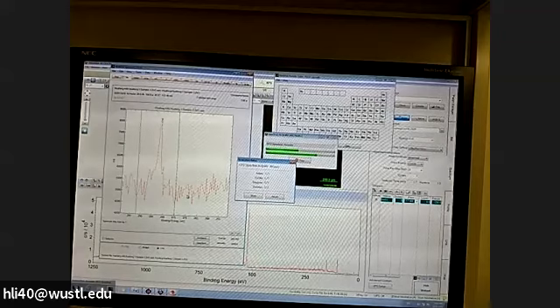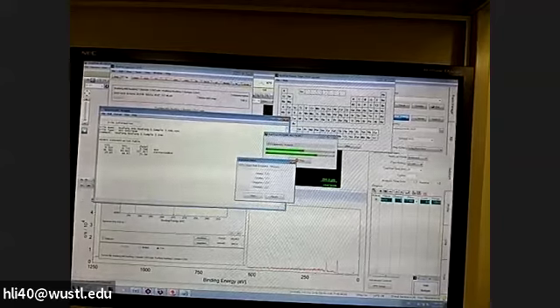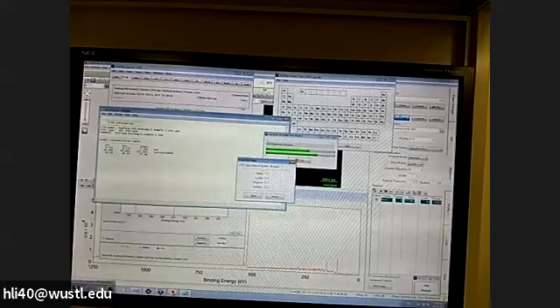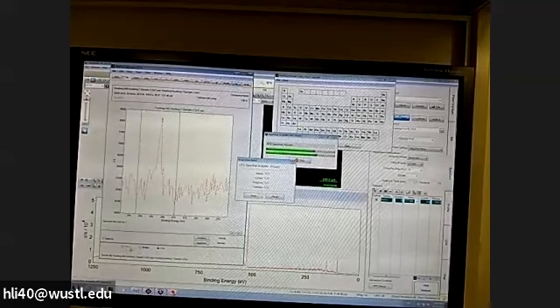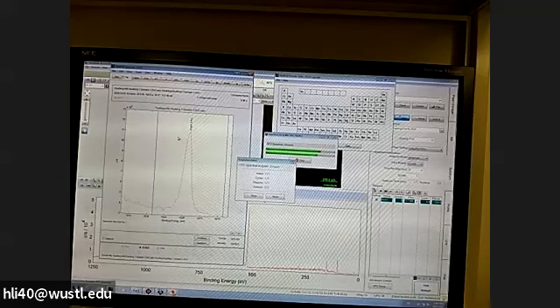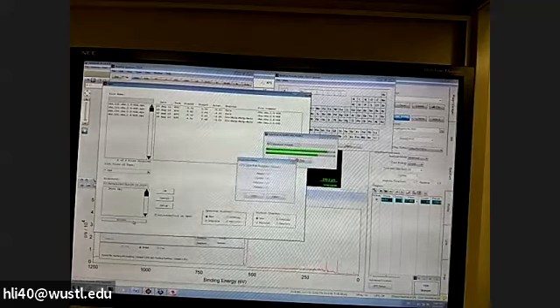After we set this, we can ask what the percentage is. We'll give you a table to tell you the percentage. You can go to File and Save As. Okay, so this is analysis. If you happen to need some fitting, here's a peak, but this is not good. Let me open a file to see whether we can see it. I'm going to open my file.